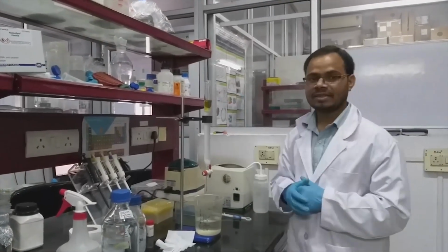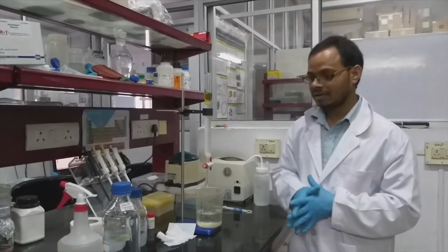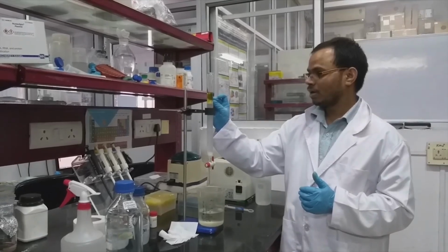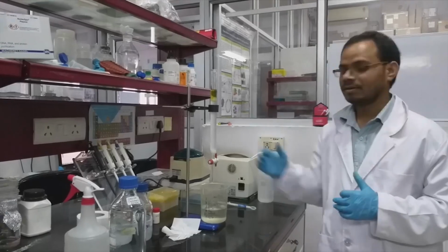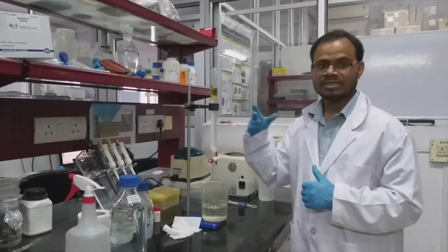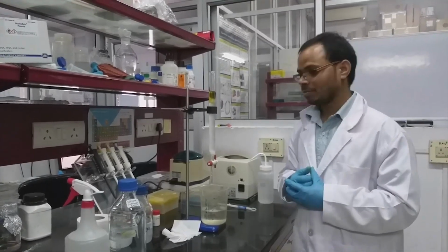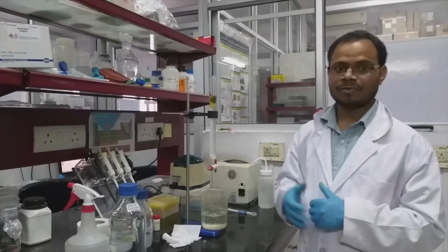Now let this settle, then we will keep replenishing with the phosphate buffer. So what happens, the blue colored compound elutes first, and the yellow one stays some time, retained by the particulate gaps, then it will elute upon addition of extra buffer.